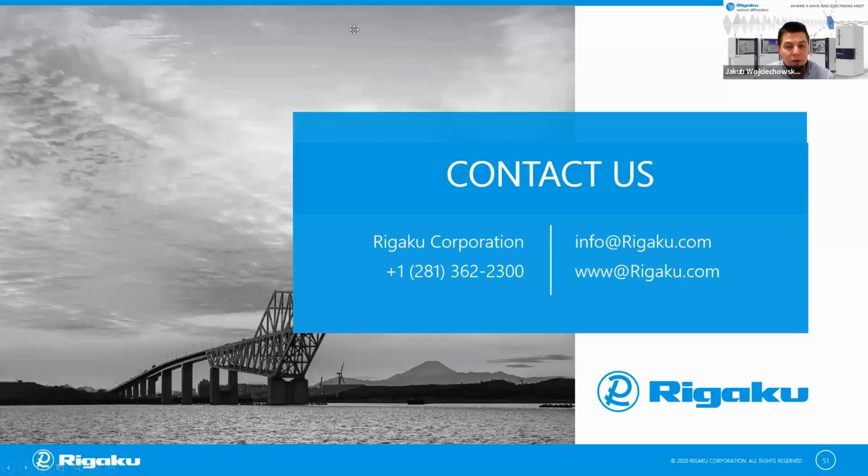Glass capillaries also work. We know that they are just more fragile and you have to be more careful with them. But we do support glass capillaries, and for example, pair distribution function measurements we do quite as standard with glass capillaries. That just requires us to measure the empty capillary again and subtract it from the sample. But the quickest way, which I always use, is cryo and mounting with a standard loop. So I don't spend much time packing capillaries or even those Kapton microtubes when I have a powder challenge for the Synergy.